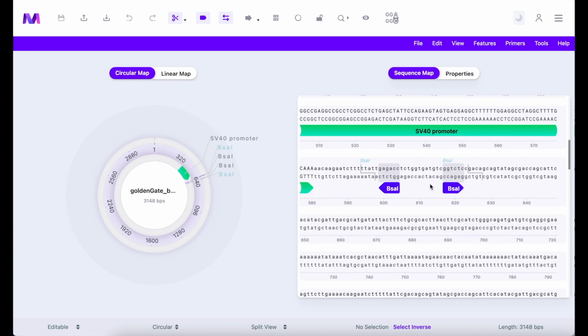Okay, now with the cut sites, remember we need to take note of what the overhangs actually are. So in the backbone we have on the left TTAT, and on the right we have GACA. So then we're going to need an insert vector that has cut sites with homologous sequences. And I've already constructed an insert vector that has this, and I'm going to show it to you.